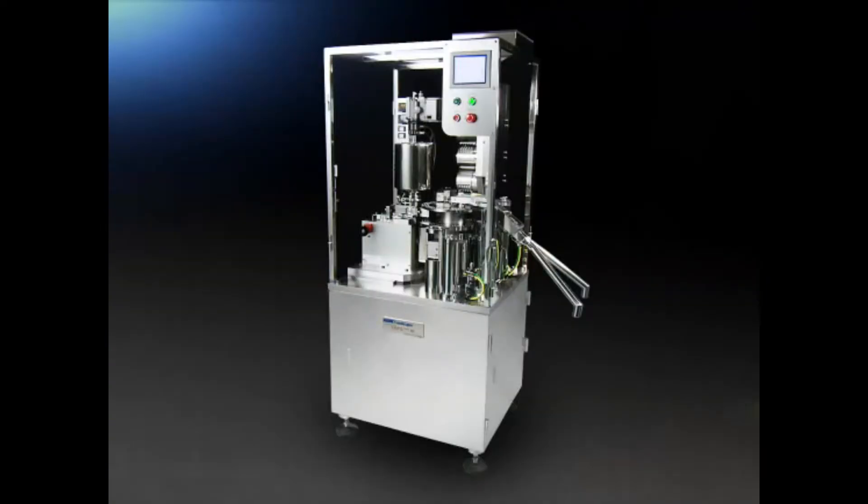The Lickville Super 40 is the result of flexible thinking and assured high performance technology. With a constant focus on the future, QualiCaps will continue to develop equipment that meets the needs of the times.